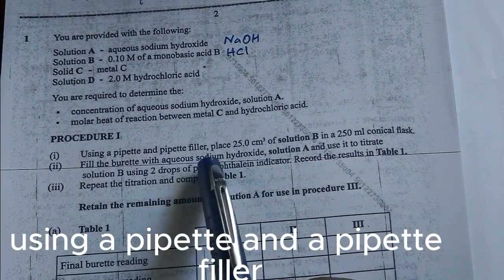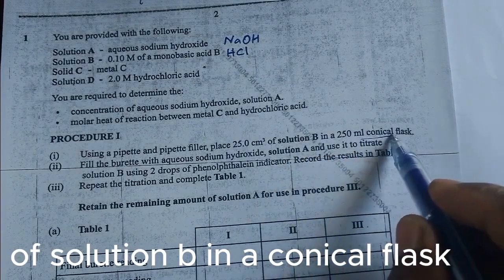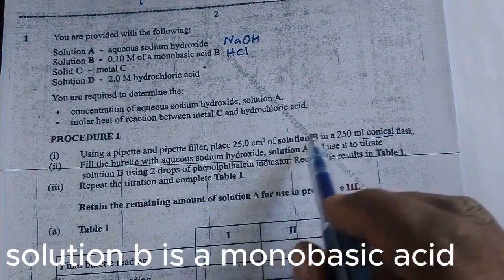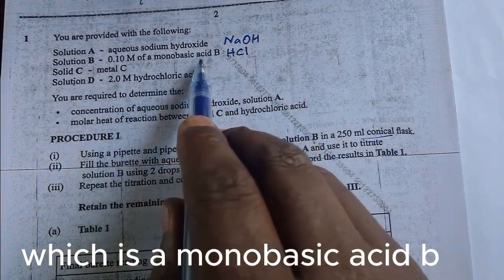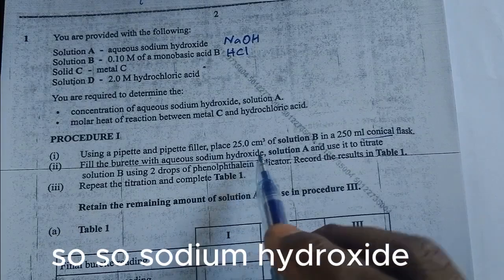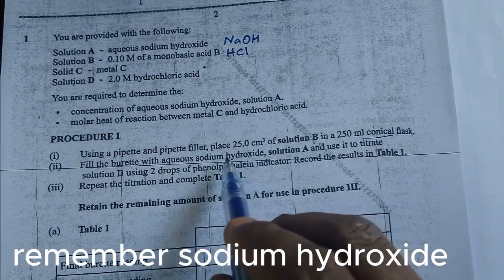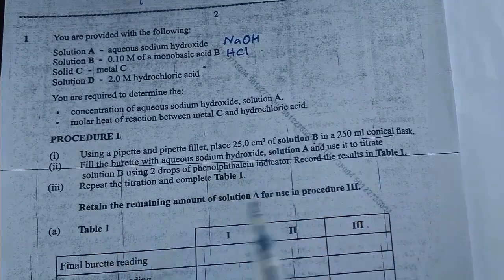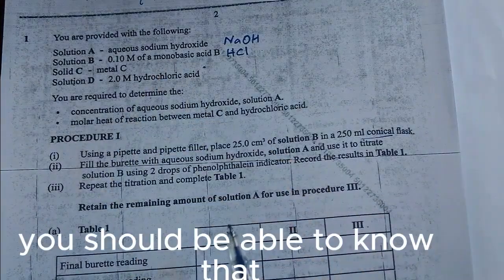Using a pipette and a pipette filler, place 25 cm³ of solution B in a conical flask. So what we have in the conical flask is 25 centimeters cube of solution B. Solution B is a monobasic acid. Fill the burette with aqueous sodium hydroxide. So sodium hydroxide solution A is reacting with solution B. Remember, sodium hydroxide, when reacting with a monobasic acid, the mole ratio is 1:1. That is the reason why they told us a monobasic acid. You should be able to know that.